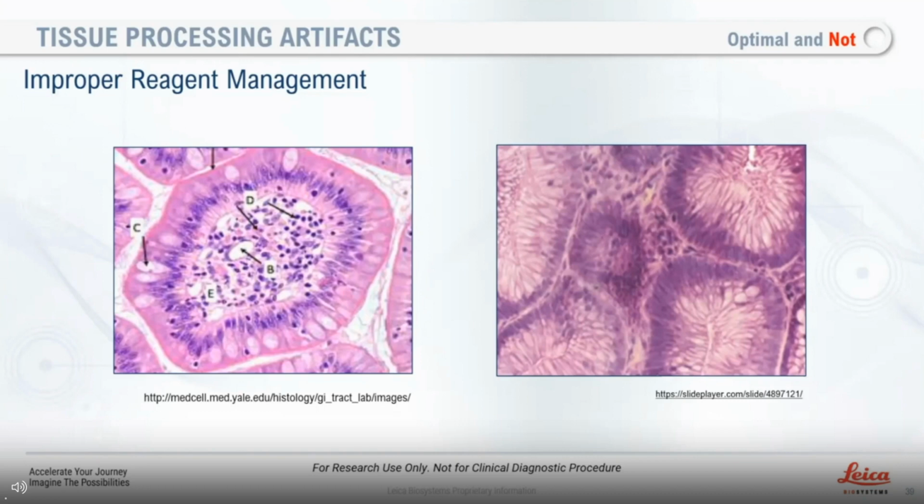With crumbling, the first thing that comes to my mind is when you're sitting at the microtome and you're using some type of freeze spray to get it cold, because we do have to have it cool to get a section, especially if you're cutting down to 2 microns. It can be difficult in a warm room. But if you're spraying it too much, it definitely will crumble. Sometimes people will think they can put paraffin in the freezer, and certainly with a -80, you don't want to do that because it will crumble.